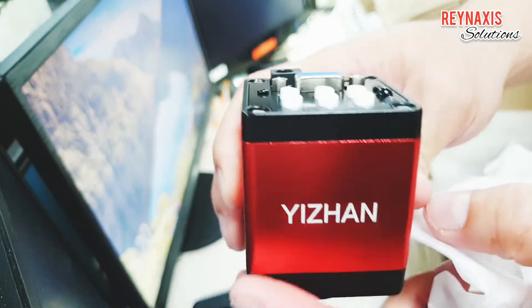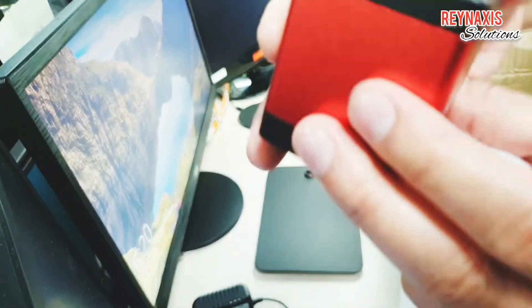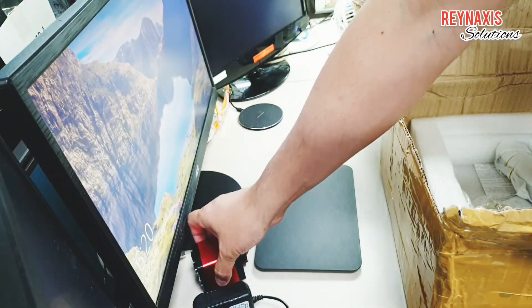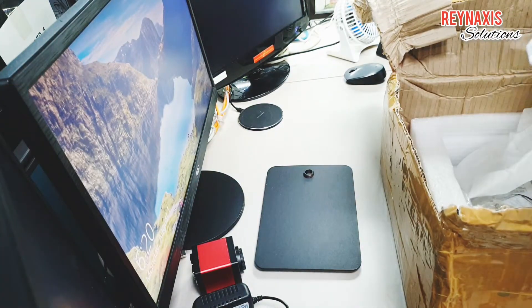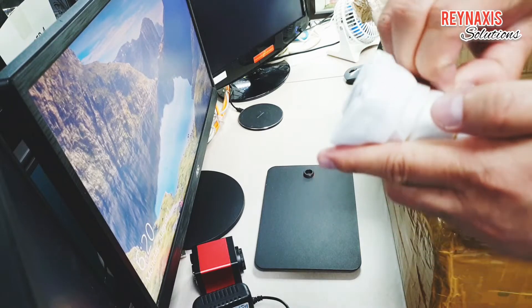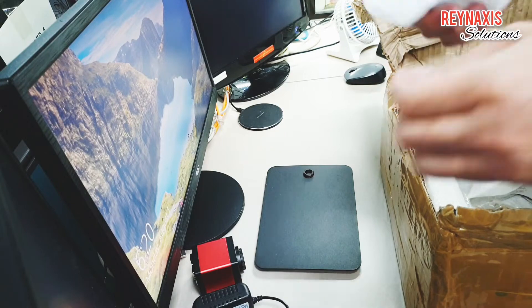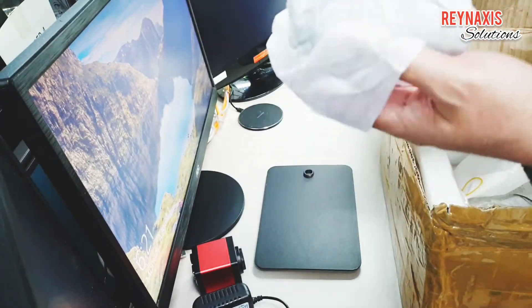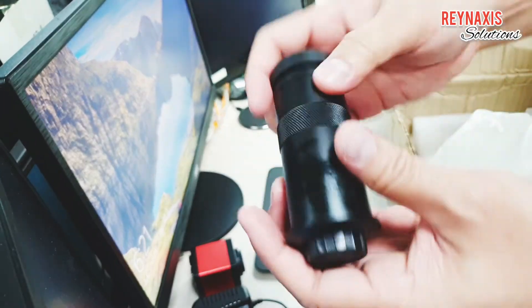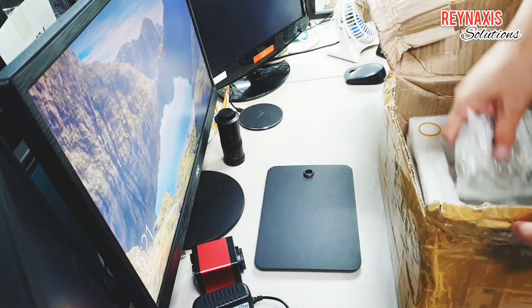This means you have an option to use a VGA or regular monitor if you don't have an HDMI monitor yet. The microscope camera feels a bit heavy and it feels like it's built for industrial purposes. The microscope itself is also heavy and looks sturdy — it doesn't feel cheap and it feels like it's worth your money.